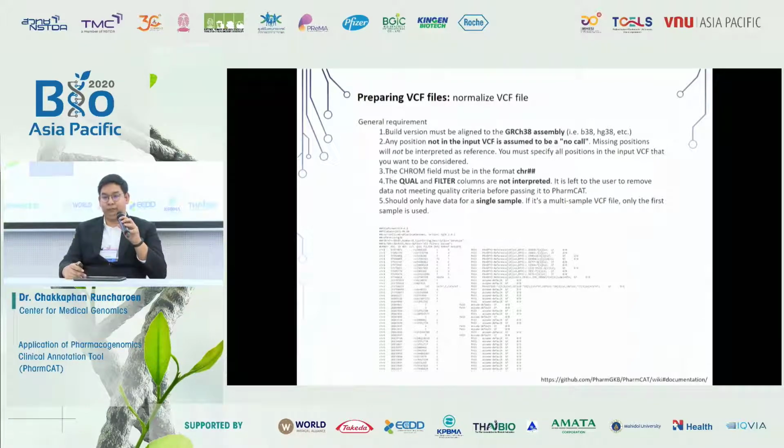And the chromosome column must be in the format chr-sharp. Also, the quality and the filter columns are not interpreted. And the VCF file should be a single sample.